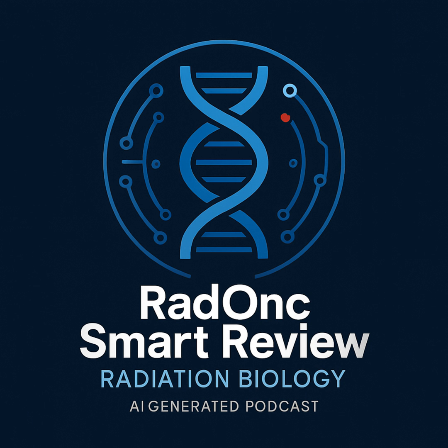Right. There's some inherent inefficiency in the process, or maybe not all cells were perfectly healthy to begin with. Exactly. And that inherent ability to form colonies under ideal zero radiation conditions, that's what we call plating efficiency, or PE. Okay, PE, plating efficiency. So it's like the baseline success rate for these cells in this specific experiment. Precisely. It tells you how good your cells are at forming colonies, even without any stress.